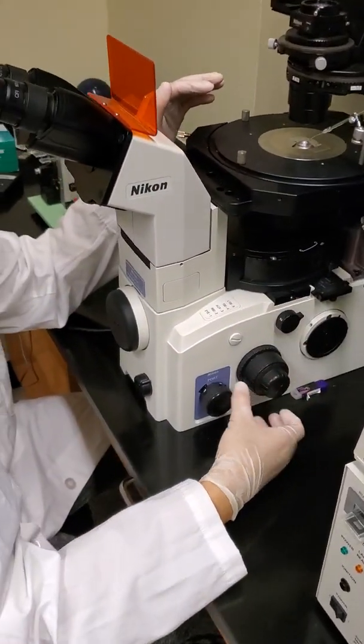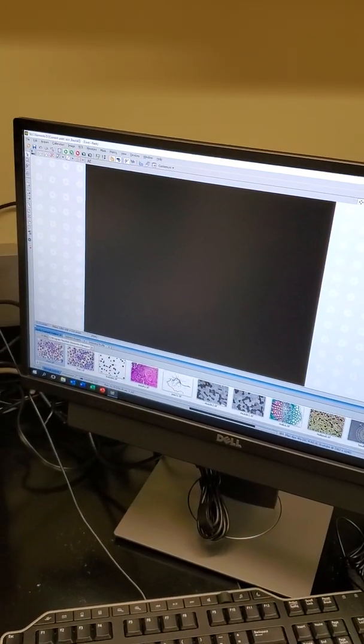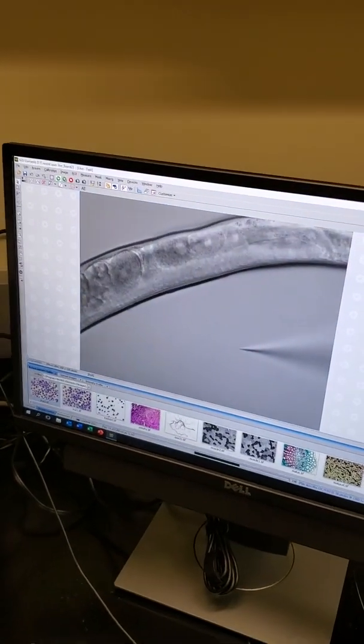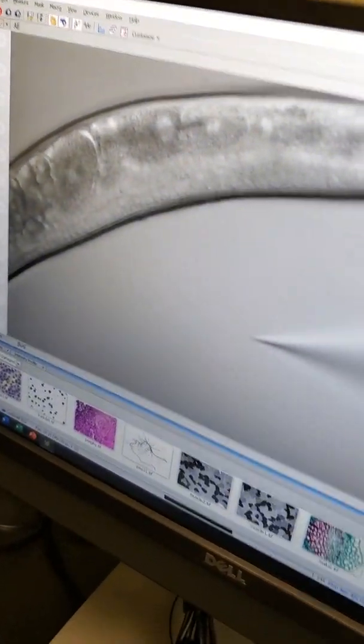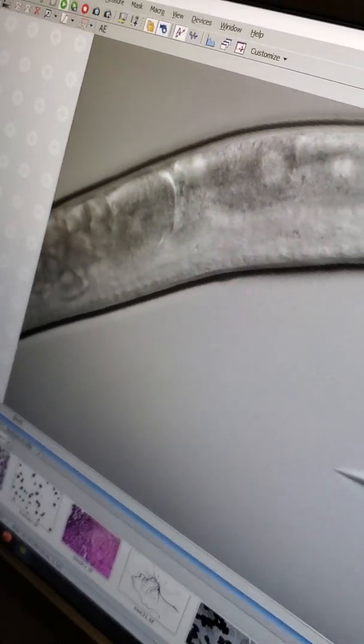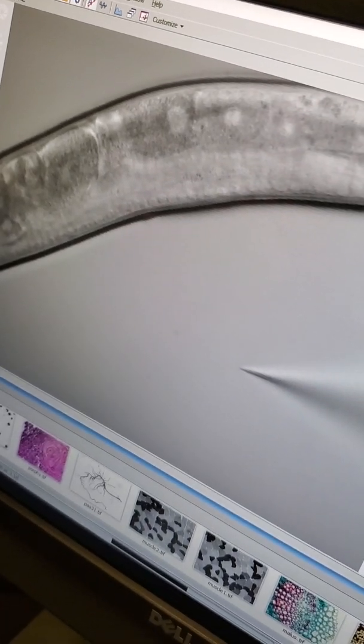So, okay, so you ready? So you swap to channel 5 so we can see what you see. And here it is. So you can see the worm. And you can see the gonads right there. And so, again, those big circles are the nuclei, which are visible in the gonads. You can see the needle over to the side.